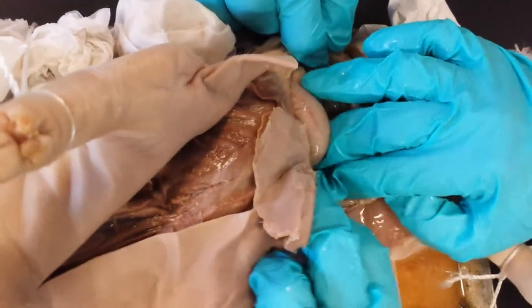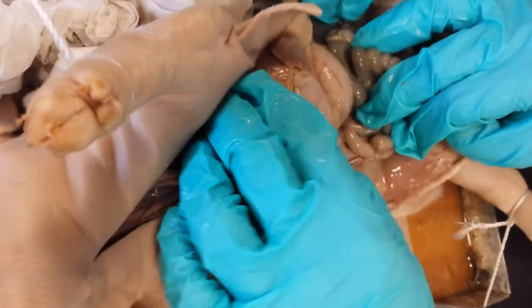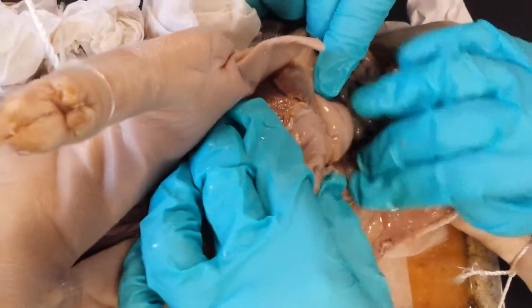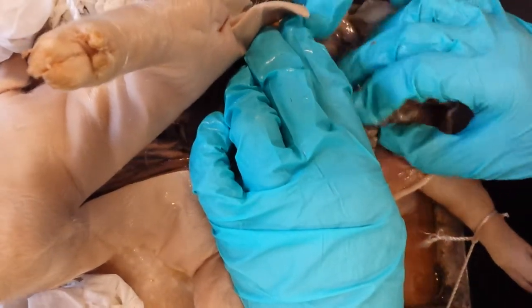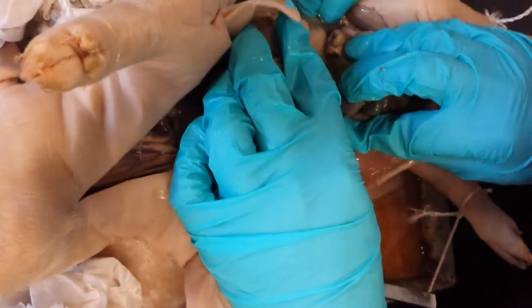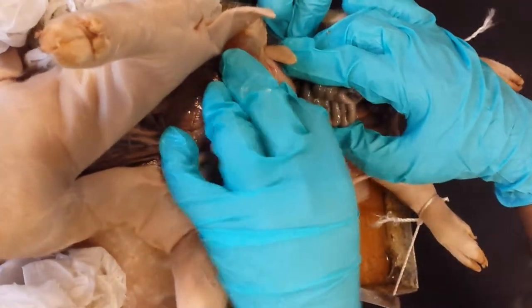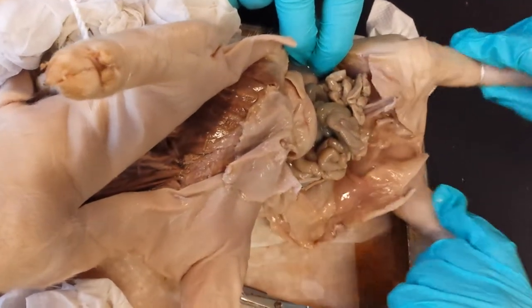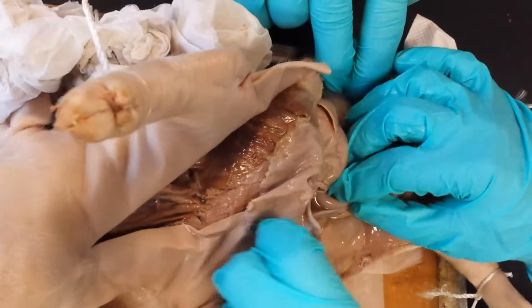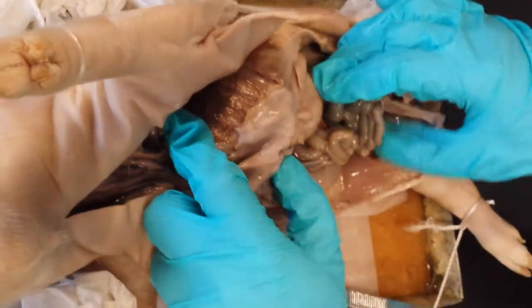Okay, now guys, after that, you have to find the spleen, which is reddish and tongue-like. It's attached to the outer curvature of the stomach. All right, but where's the stomach? It was that thing we were looking at earlier. Yeah, I want to say it's the bone, isn't it? Wait, what? Bone? That's the stomach? No. Wait, I think I see something red-like. Tongue-like, you said? Yeah, reddish, tongue-like. Is that it? This thing? I don't know. Like a tongue? Oh, God, my sinuses. My allergies. It smells lovely. The pancreas is a large white organ lying directly below and extending along the underside of the stomach. God, this is the pig that someone gets an F on. They just put a big F on the eye, and they throw it in the pile of F pigs.